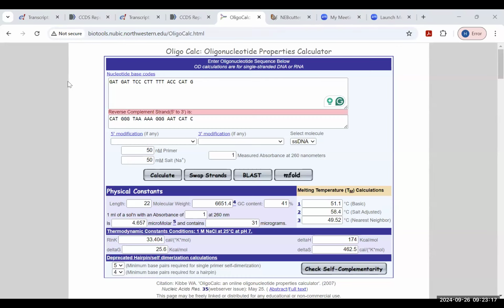So now I will copy this part. And if you remember in my slides, when you go back to my slides later on, you will see that this is the sequence that I chose for a primer, but without the G because I didn't add the G for adding the GC content. Okay, so primer 1 is done.